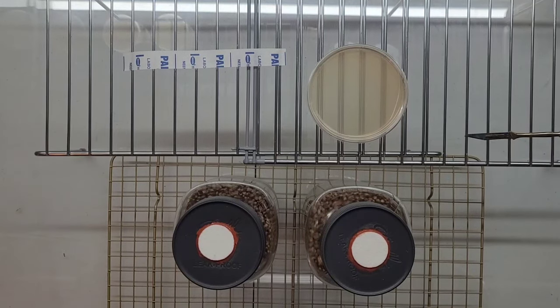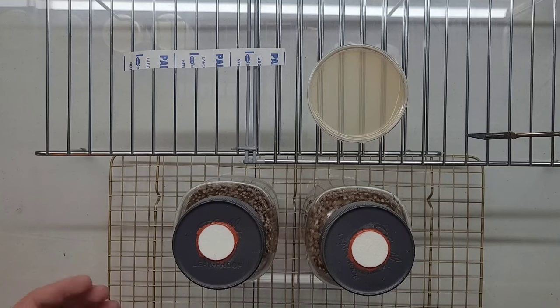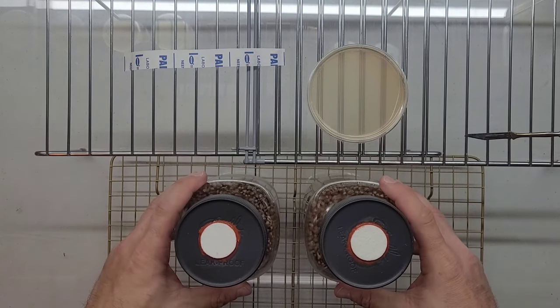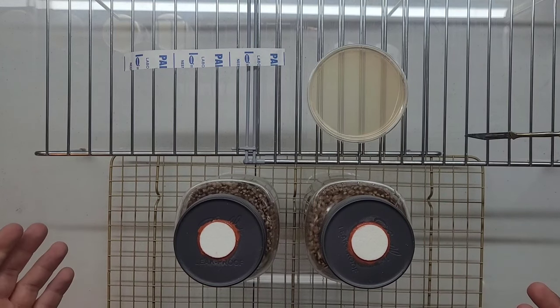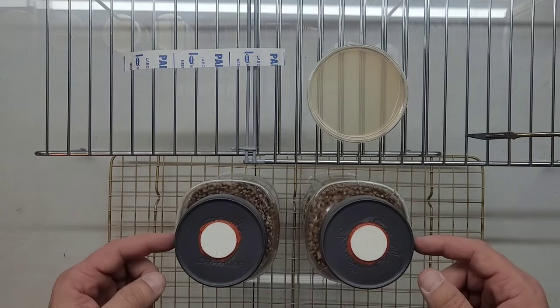Now I'm aware that glove boxes do exist and that they are a thing. However, microbiology, or at least this application of microbiology, is not the intended purpose. The intended purpose is to have a sealed container where the atmosphere has been replaced with something like argon or nitrogen because the materials you're working on are sensitive to the exterior atmosphere. So it doesn't really apply to mushroom cultivation and therefore should be avoided because of the reasons I stated, which are turbulence and a higher likelihood of depositing airborne particles in your sterile media.